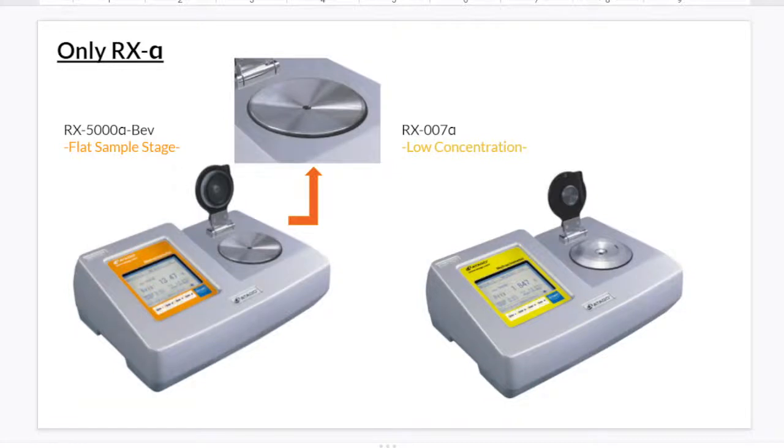These two instruments only have the α series. The 5000α BEV has a flat sample stage as shown in the image. The 007α is for samples with low concentrations, like tea.